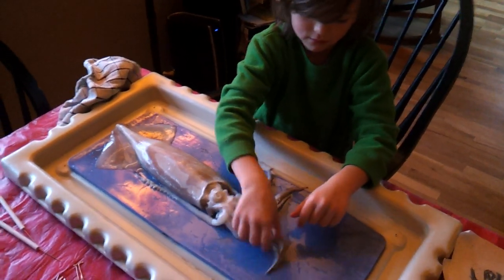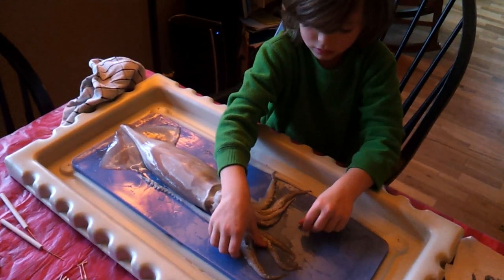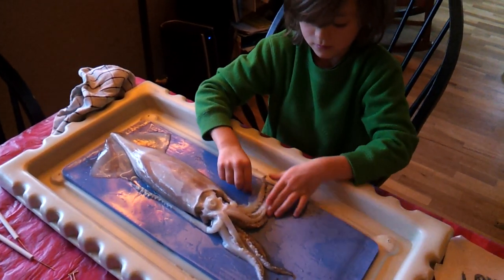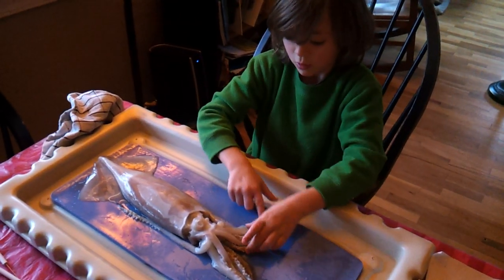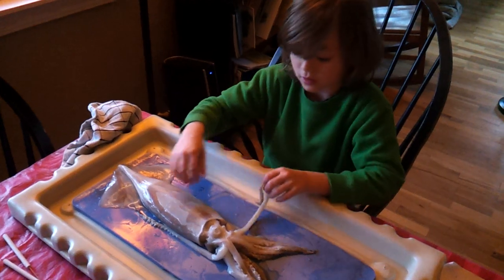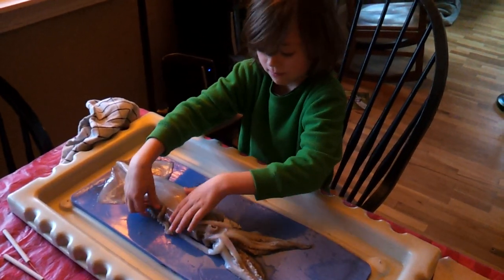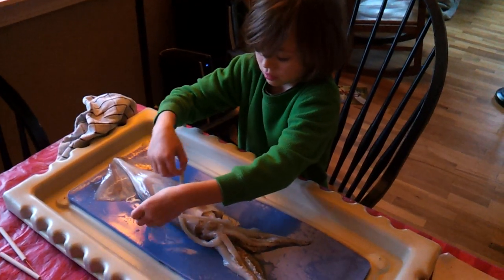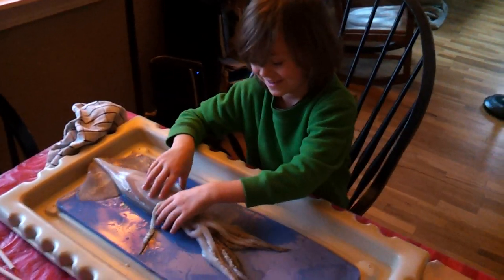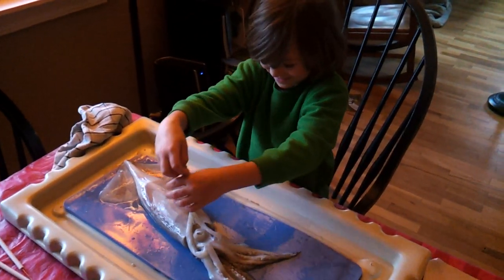Good job — eight. So what are we going to do next? Now that we've identified the external anatomy, what do you think we're going to do next? We're going to cut open the squid. And after we're done dissecting it, what are we going to do to it? Eat it. We're going to eat it? Yes.